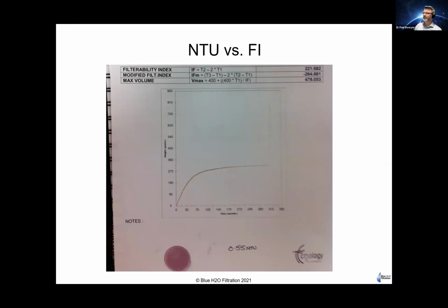And to give you an example of that, this was a Barossa Shiraz that was put through a crossflow. Half of the job was bottled immediately with no problems whatsoever. The filterability was perfectly fine. Two months later, with no subsequent additions, they came back to bottle the other half, and it blocked the membrane very, very rapidly. And when we measured the filterability, it was terrible.